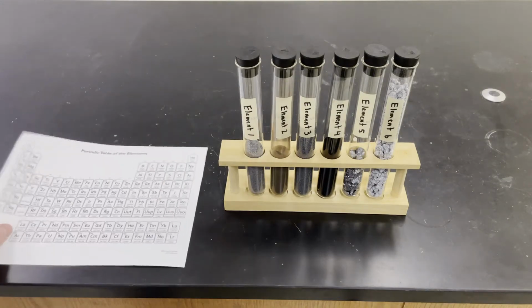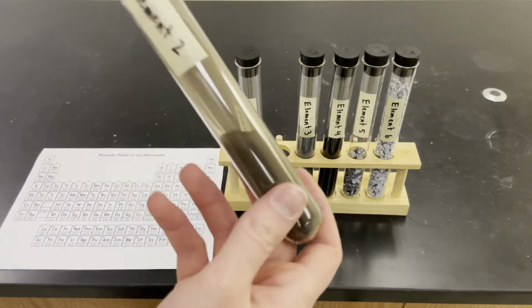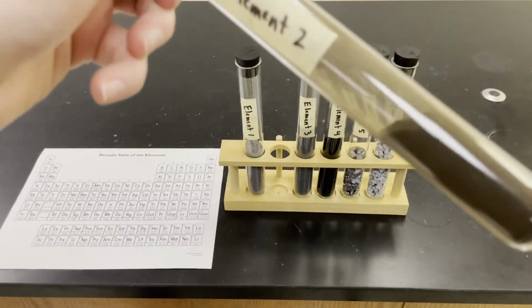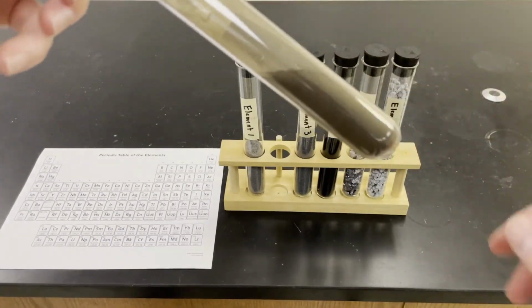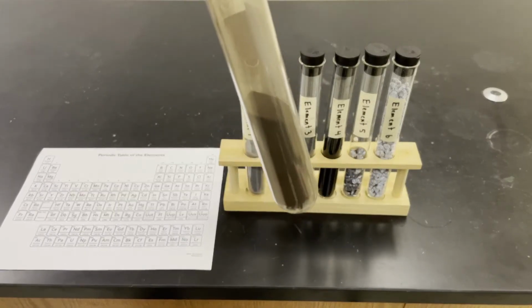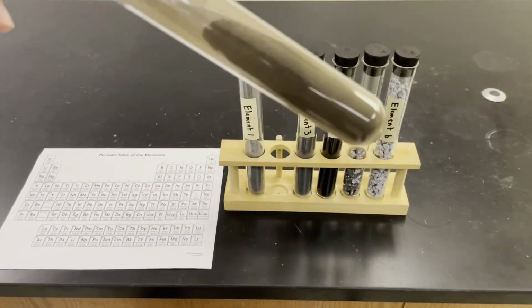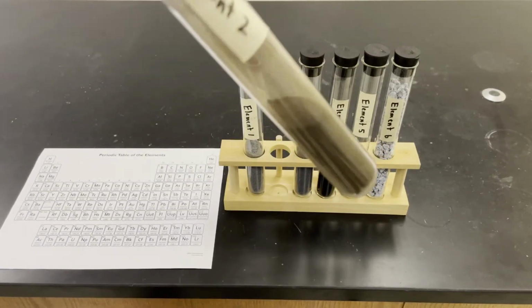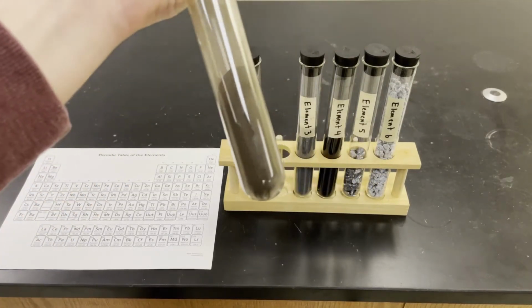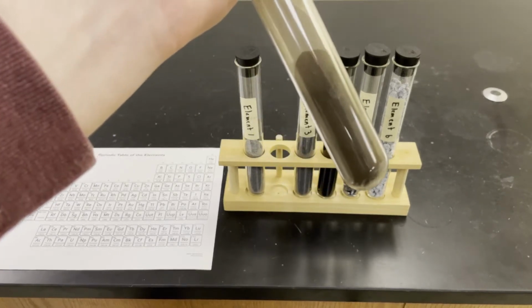Let's do the next one. This is element number 2. It's kind of a dark brownish powder. Let me see if I can get it to focus. All right. So there is also 1 mole of this element in here. Its mass is 55.85 grams in this 1 mole.